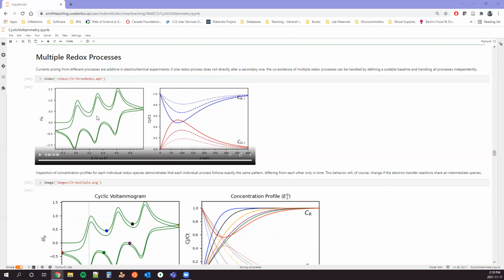And this is where I recommend that everybody, instead of sitting down and doing one experiment and being done, vary scan rates. You can vary them by orders of magnitude fairly quickly. Of course, it's like impedance: in impedance, when you go to low frequencies, it really adds time onto your experiment. But sometimes those data points give you the information you need.